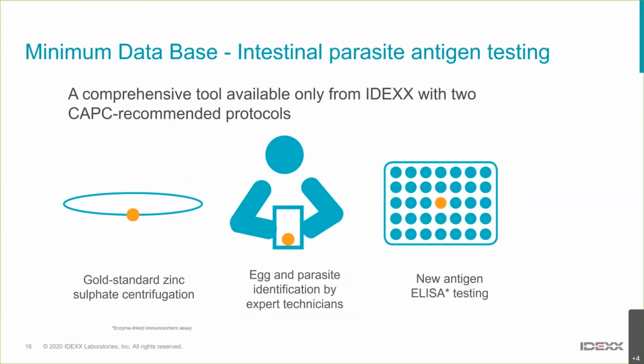So, testing has shown that with roundworms, we're probably detecting half as many again infections with combining the centrifugation flotation technique with antigen testing. And for whipworms and hookworms, we're more than doubling the number of infections we're detecting. And whipworms can be so challenging sometimes with the intermittent shedding of the ova. So it's a good thing to be considering.